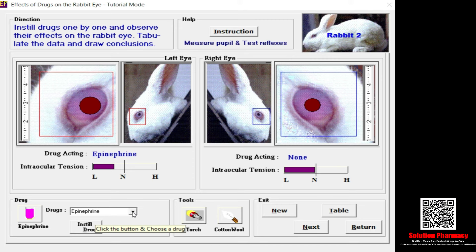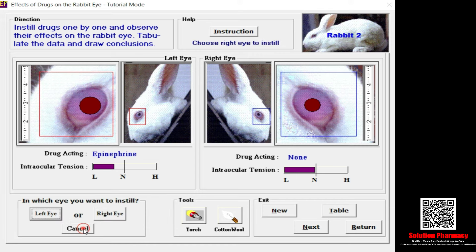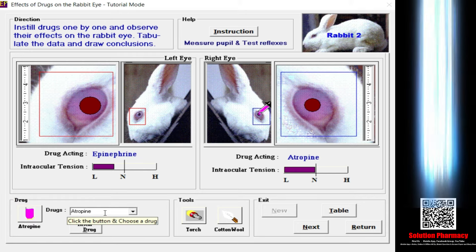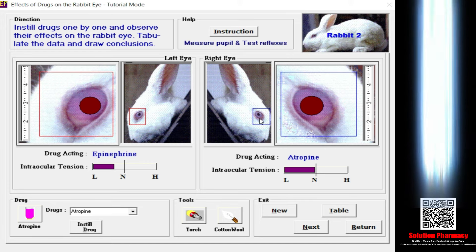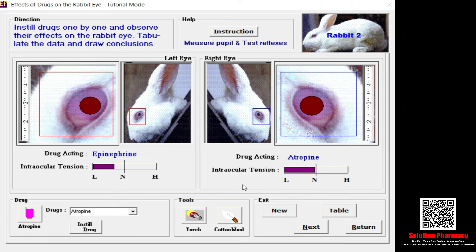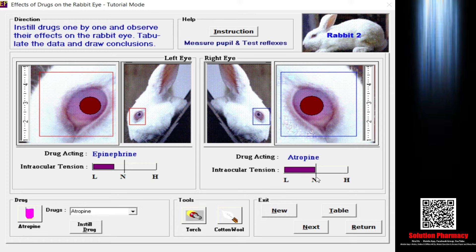Let me change to another drug using the right eye. The next drug is atropine — the right eye is currently in normal condition. I select atropine, click the instill drug button, then select the right eye because the drug is already acting on the left eye. After placing the cursor on the right eye, you can see changes in the right eye diameter as well — atropine also produces mydriasis. However, the intraocular pressure is not changed; it remains in normal condition.